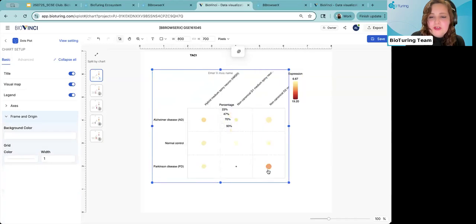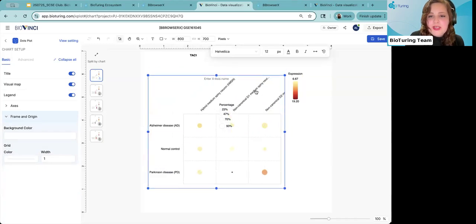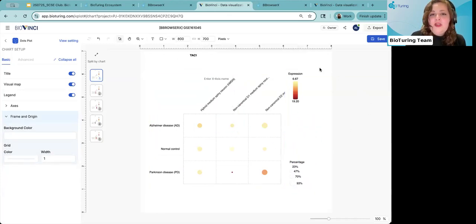Okay, so I'm just going to show it here. Now that we have this, we can see the annotations, or we can actually change the annotation name as well. So for here, these are some of the main focuses that I wanted to show: how are we able to generate these different tools?